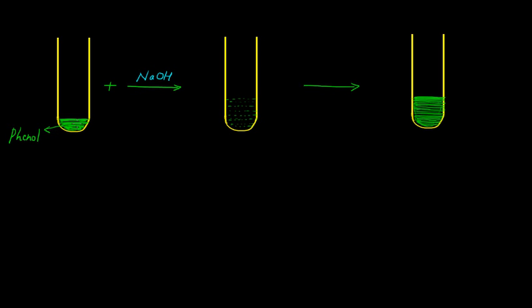This indicates that phenol is present in the test tube and that can be confirmed by adding 1 to 2 drops of concentrated HCl into the test tube. By adding concentrated HCl, again the formation of precipitate takes place. And this indicates or confirms the presence of phenol in the test tube.